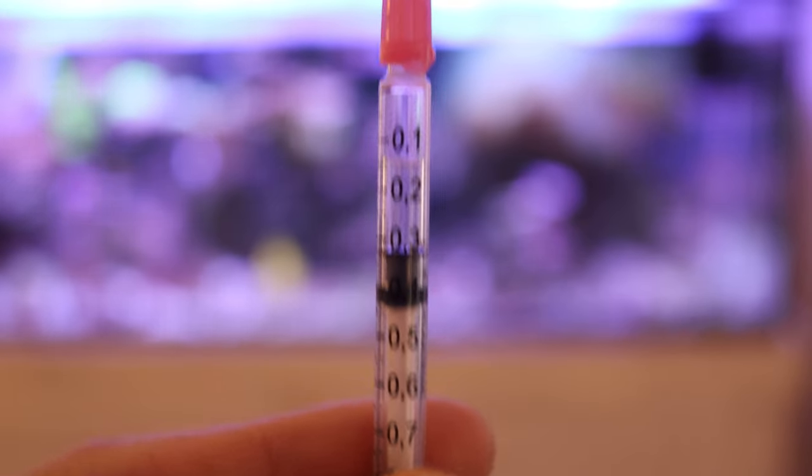Do you test your reef aquarium and how often do you test? Are you testing manually or do you have another way of testing your aquarium? Testing your aquarium is very important to know exactly what is going on in your aquarium, to know the water chemistry of your tank. So we test for things like calcium, alkalinity, and magnesium when we are keeping corals. And especially when setting up a new tank, when going through the nitrogen cycle, you want to test for ammonia, nitrite, and nitrate.